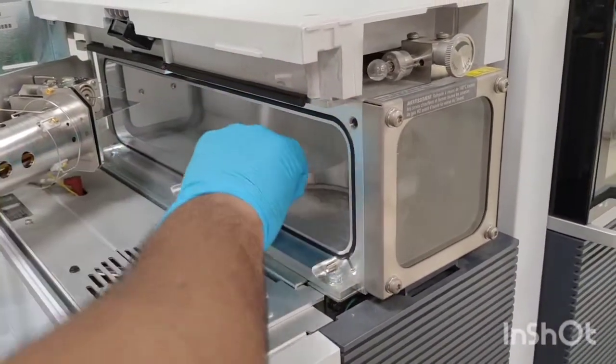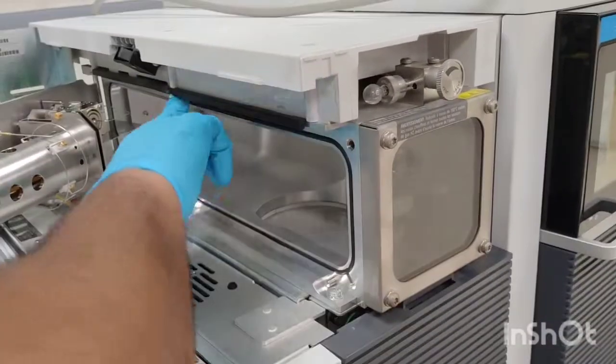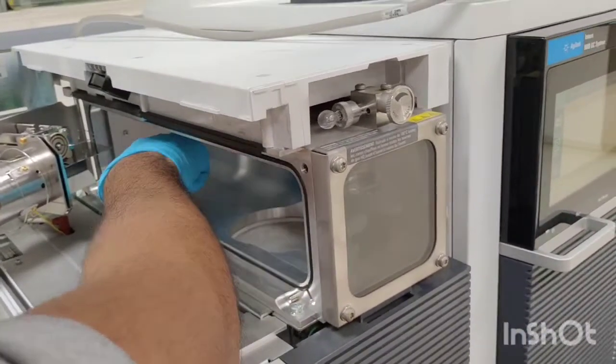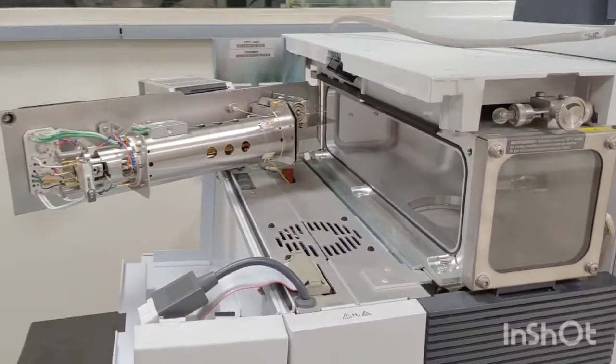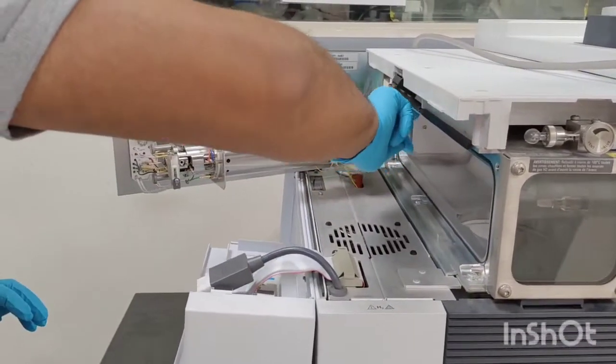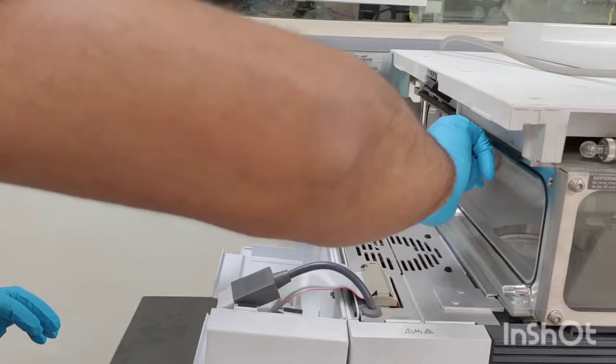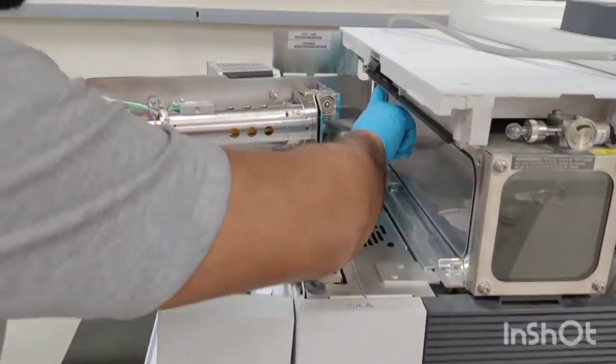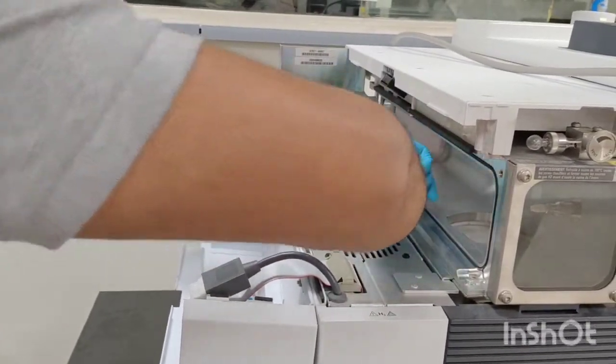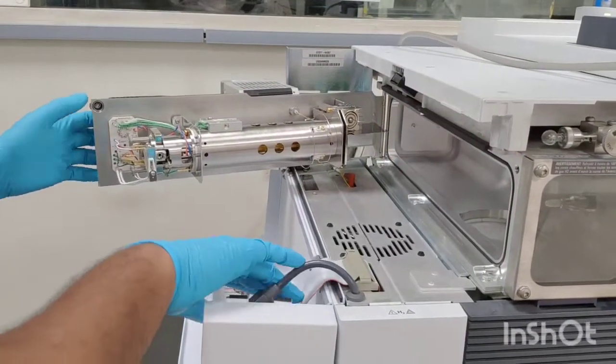Some of the times when we open the ion source, this O-ring may come out of its slot and when we try to restart the GC-MS, it may show some kind of leakage. So just using fresh gloves, just press your finger over here outside, nothing inside, that O-ring is perfectly fit, fixed.